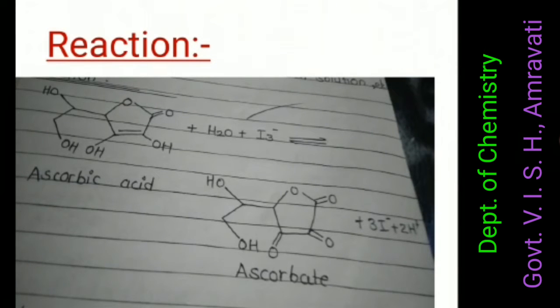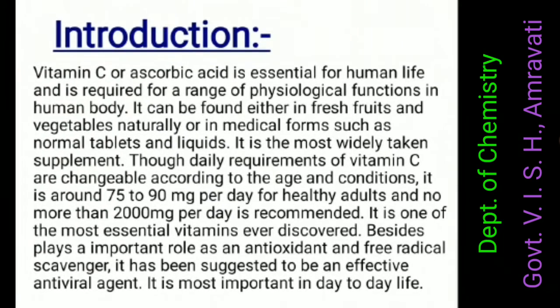And this is the reaction which we have to perform. So first of all we have got ascorbic acid. After that we have to do this and we'll get the product, that is ascorbate. So before starting the practical, let's see a short introduction about this experiment.